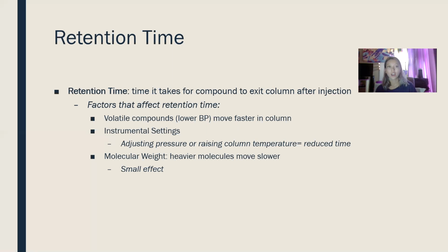You're going to have more than one curve, especially in the beginning when you have that mixture ready to go. You're going to see two curves, and that indicates two different things in the compound. You'll see that more in experiment 5 when you make your own graph. You'll see 2-butanol and 2-pentanol. And then further on, because you collect 3 samples in total, in the third sample you're going to see that the first curve that represents 2-butanol is a lot lower, or won't even be a curve at all, and the only curve you can identify is 2-pentanol.